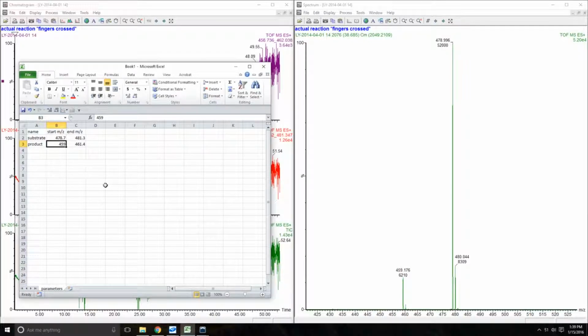One of the nice things about this script is that as long as you have a good calibration on every spectrum that you run, or every experiment, you can use these values to sum multiple experiments. You can just use these parameters over again.